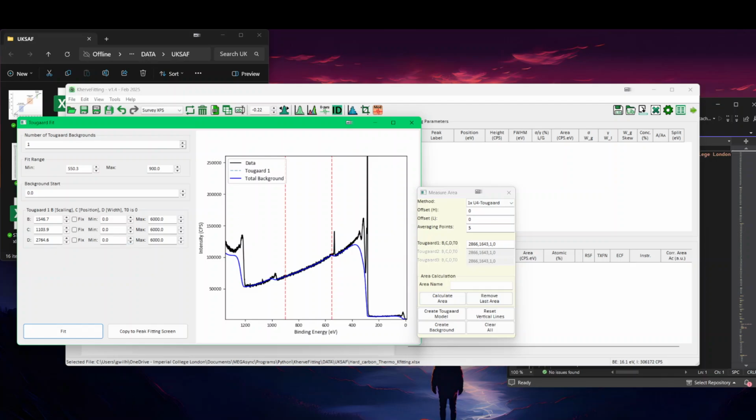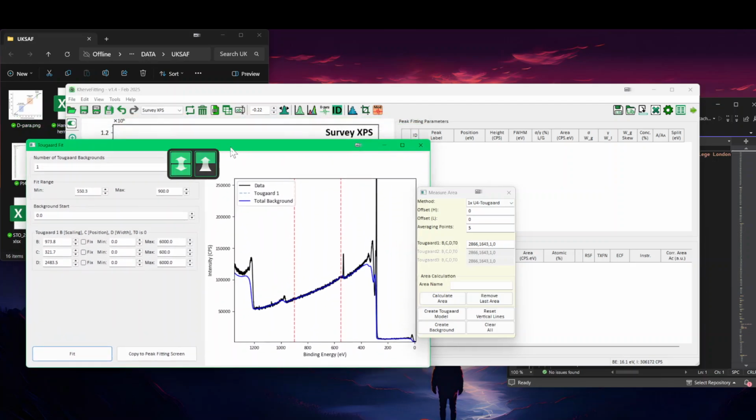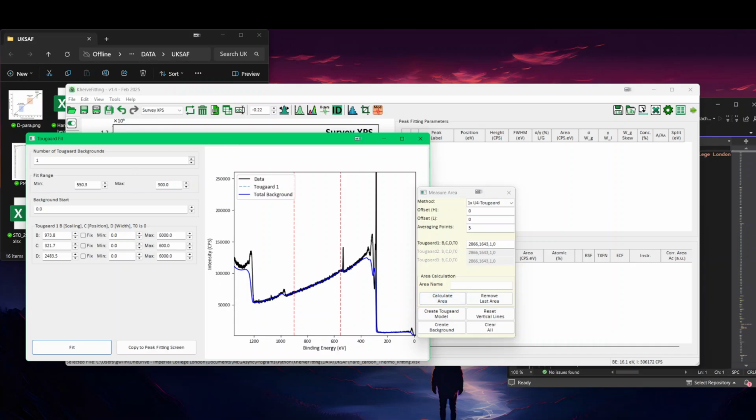You can actually change all this by deciding I should have something around, no, not bigger than 600, let's say. And now if I fit it, then it will restrict the C to be 600, or it found 321. So that may be the one you prefer. I'm not suggesting this is the correct one. This is one possibility, and it's for you to find out which one is best.